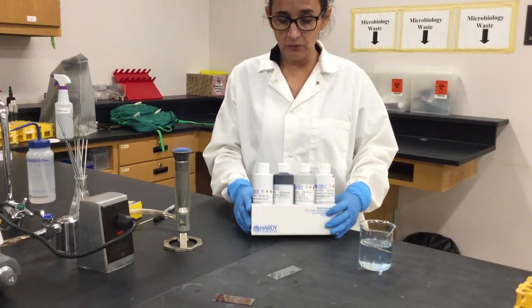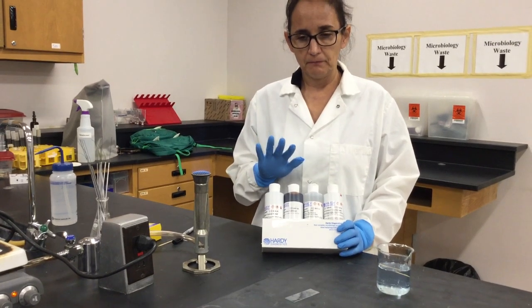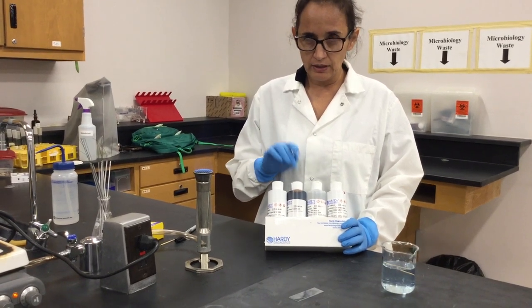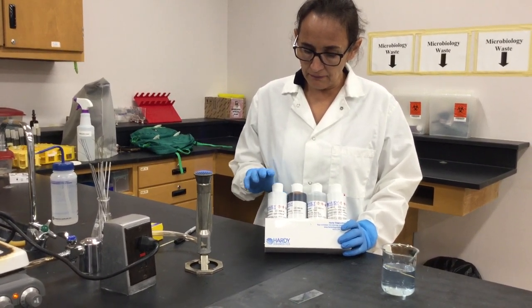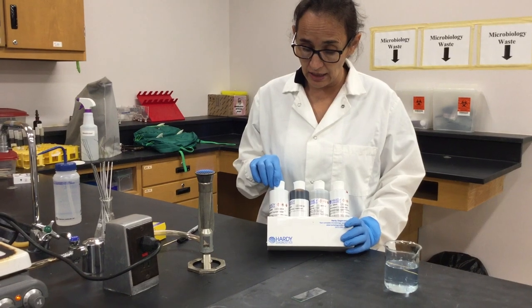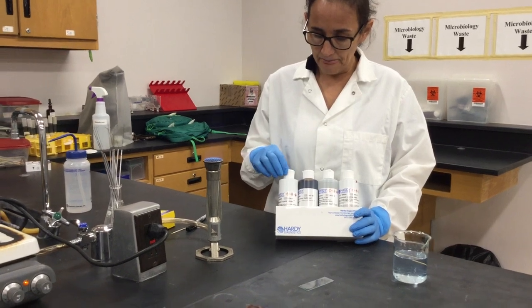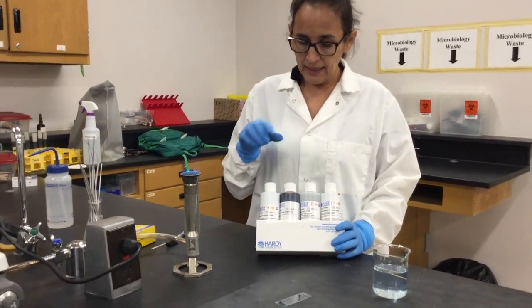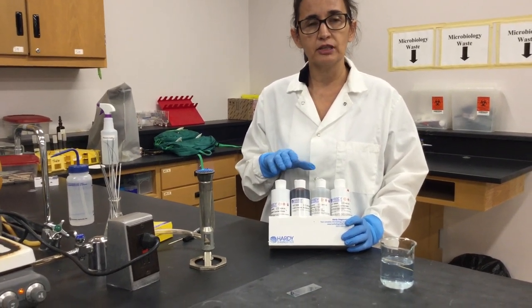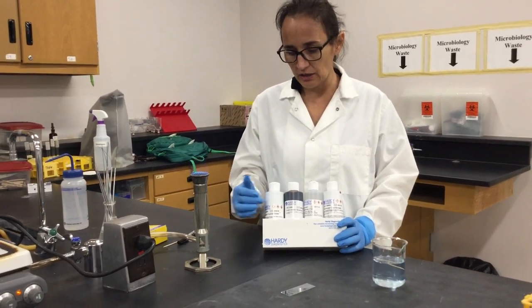While this is drying, I'm going to explain the steps of gram stain. So we have four major reagents or steps that we do in gram stain, with a rinse of water in between. So you will have to add crystal violet, which is the primary dye. It's a positively charged dye. And this one, you will add for a minute after you have heat fixed your slide. Then you rinse with water. And after that, you add Gram's iodine, which is a mordant, meaning that it's going to create crystals of crystal violet, so it makes the crystal violet bulkier.